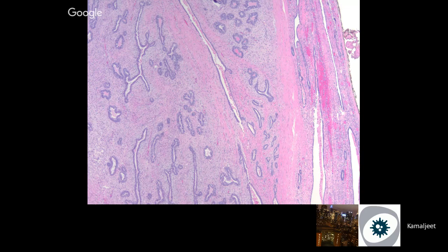So you will see the epithelial component is also proliferating. You can actually appreciate it in this one. It's like a UDH, and at the same time the stroma is very cellular, and it's evenly cellular. So that would make it sort of a juvenile fibroadenoma.